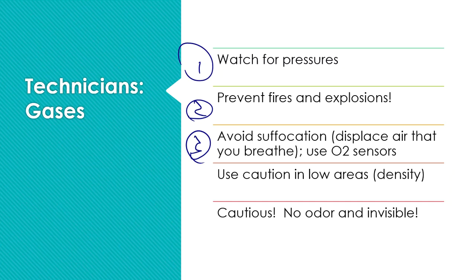Number three, it says avoid suffocation. So keep in mind that if you do get leaks, and if you don't catch those leaks because you don't smell it, you don't hear it, you've not brought out the leak detector wand, Harry Potter wand, right? Then you can actually start displacing the oxygen that you need in order to breathe. And if that gas pushes that oxygen out, then you're going to begin to suffocate. And sometimes you might not even realize it. You might just get weak-headed, a little fainty, and then you'll pass out and go into the floor, and you'll never know any different.